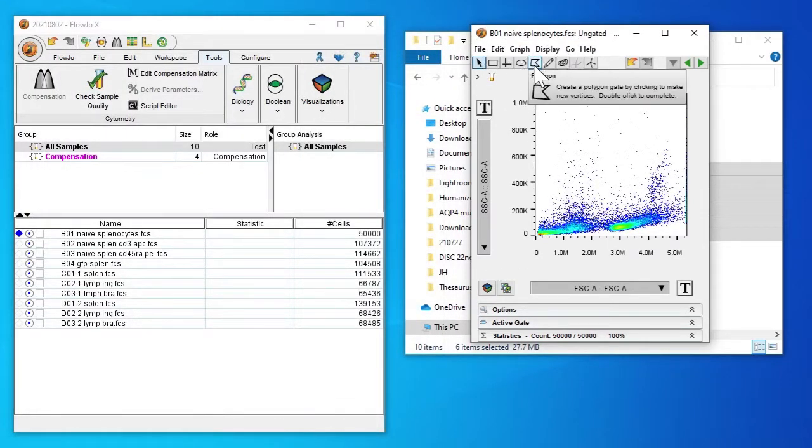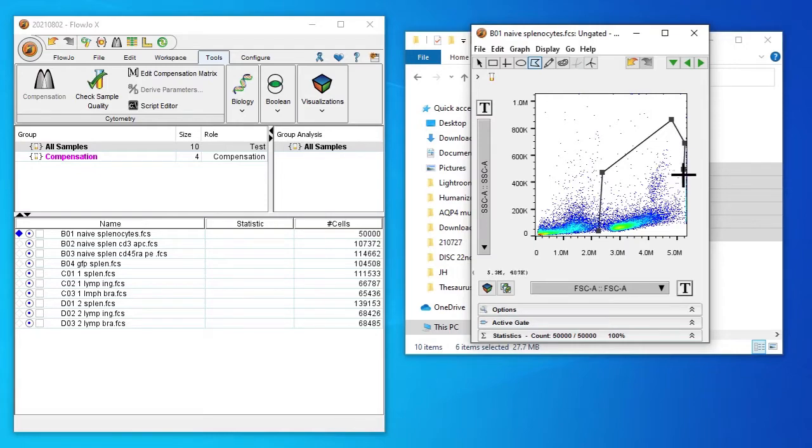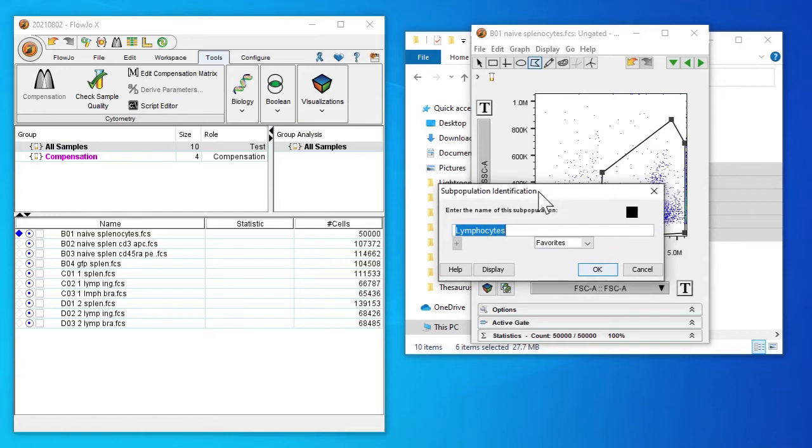Now I'm going to create the gate for our lymphocytes. Usually I expect to see something around 3 million for the forward scatter. I'll set this as lymphocytes.